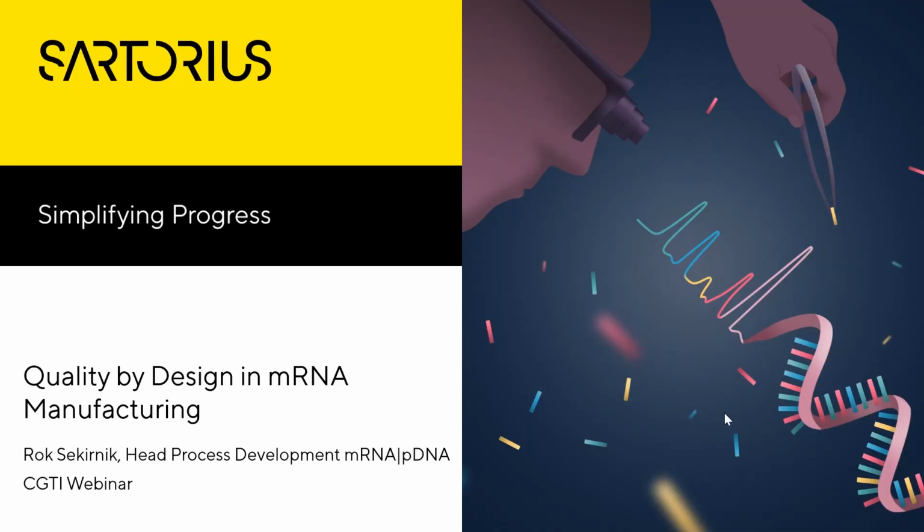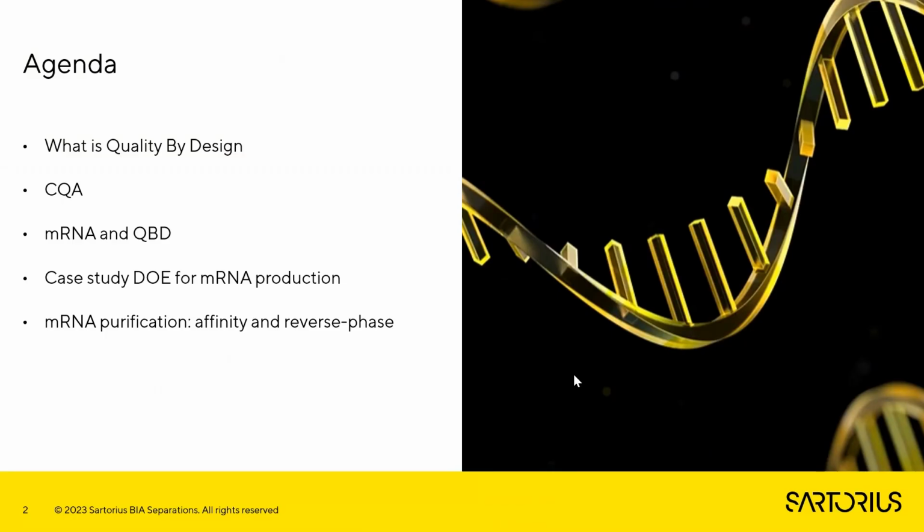Thank you, Lauren, for this nice introduction, and it's great to be back to give this webinar on everything that we've been working on since you last heard from us. Today's presentation is really going to talk about how to build in quality by design in mRNA manufacturing. And as Lauren has already announced, I will try to cover some aspects of design of experiment application in the context of IVT reaction, the reaction with which we produce, I believe, currently still all mRNA vaccines.